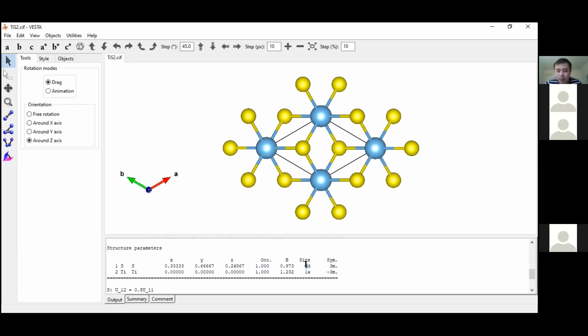So 2 means that if we put an atom in this 2d site, which has this atomic position, 1/3, 2/3, and some number close to 0.25, then the symmetry elements, remember we have the 3-bar symmetry elements, we have the mirror symmetry elements, all the symmetry elements will act on this atom and will generate 2 atoms in one unit cell. And these 2 atoms include the original atom itself.